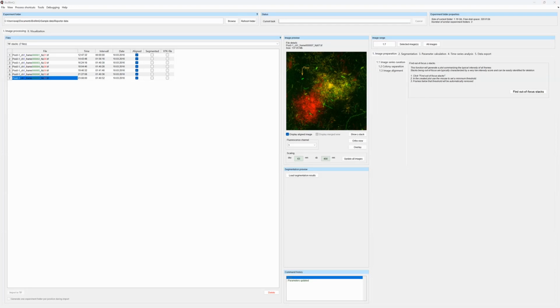So maybe we can talk at the end, or maybe we can figure it out aside. And I can move on in the meantime. Yeah, it might really be about the MATLAB version. BiofilmQ was written in 2017, so. I'm using 2023. Okay. And it's working, so I'm guessing there might be something else, but I would suggest we look at it later. Yeah.